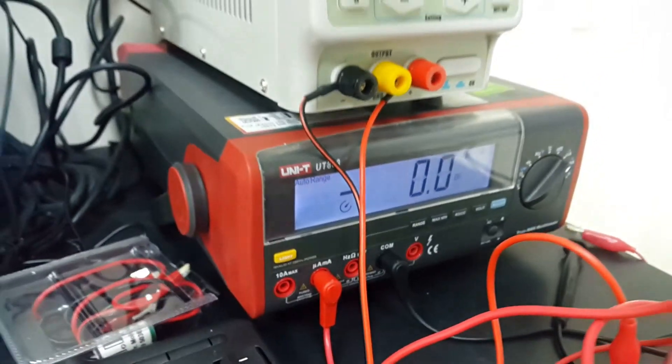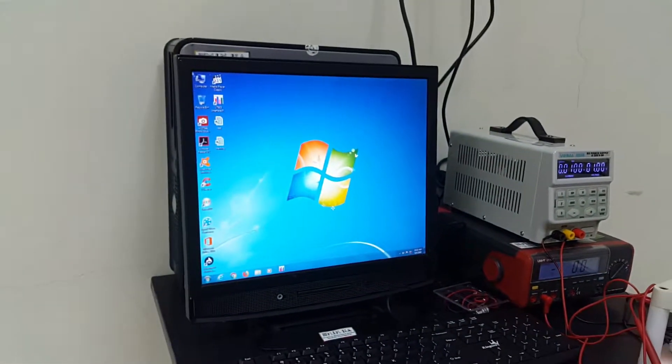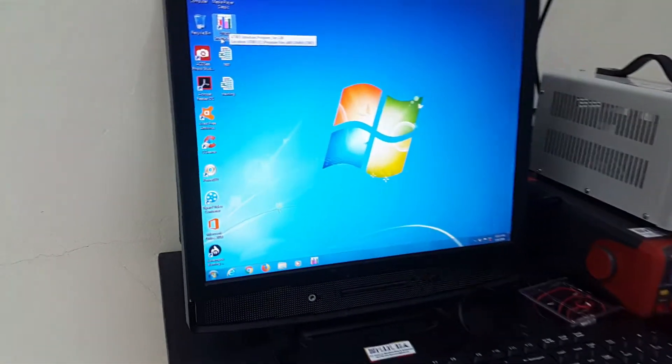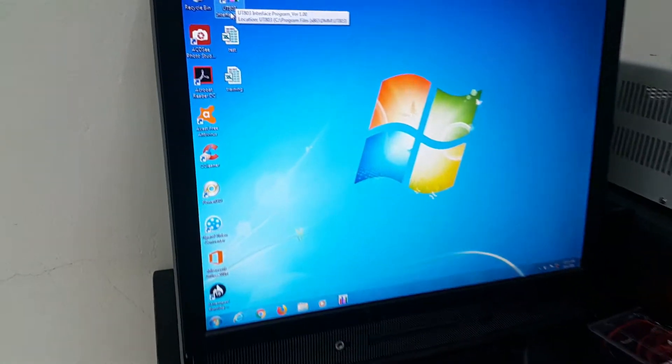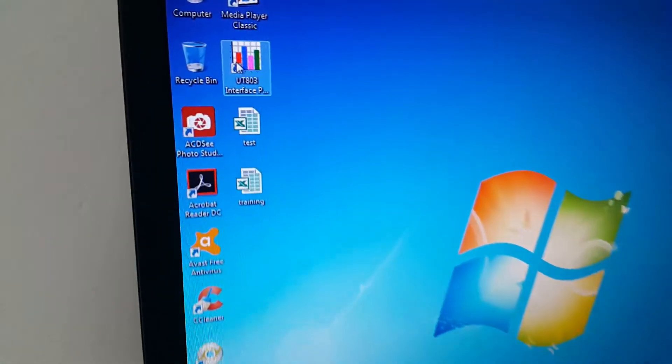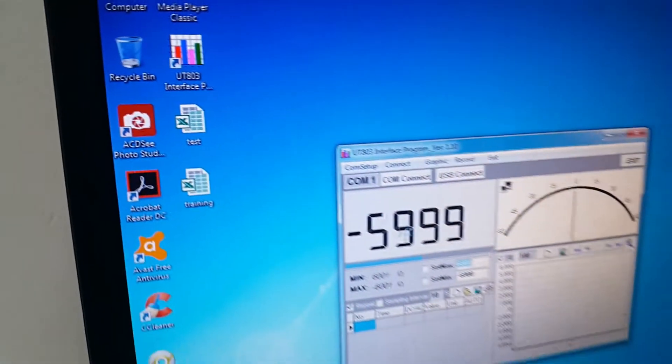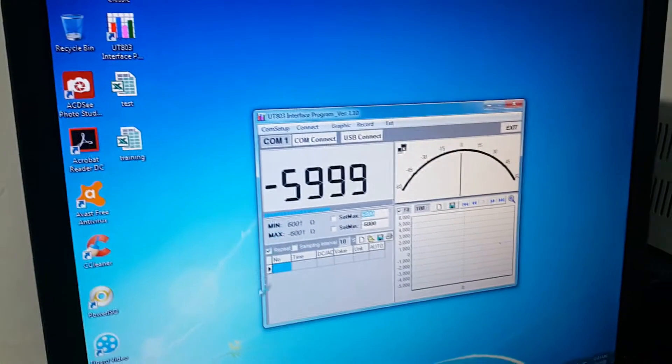Next, for the PC, we have to make sure that you have this software, UT803.